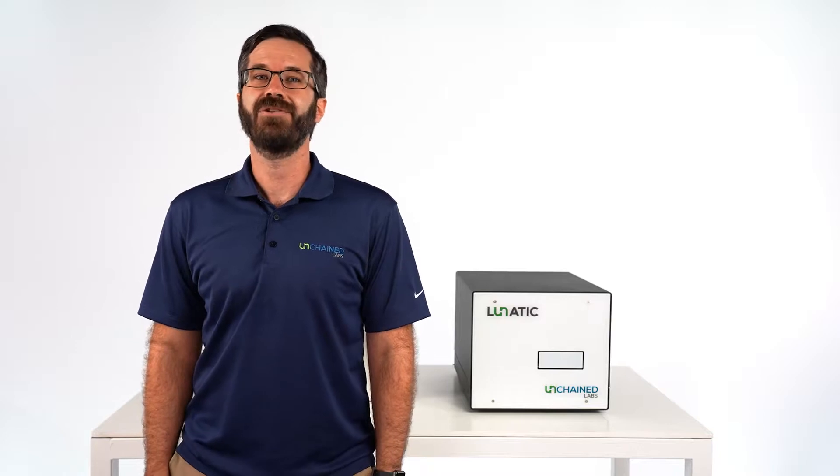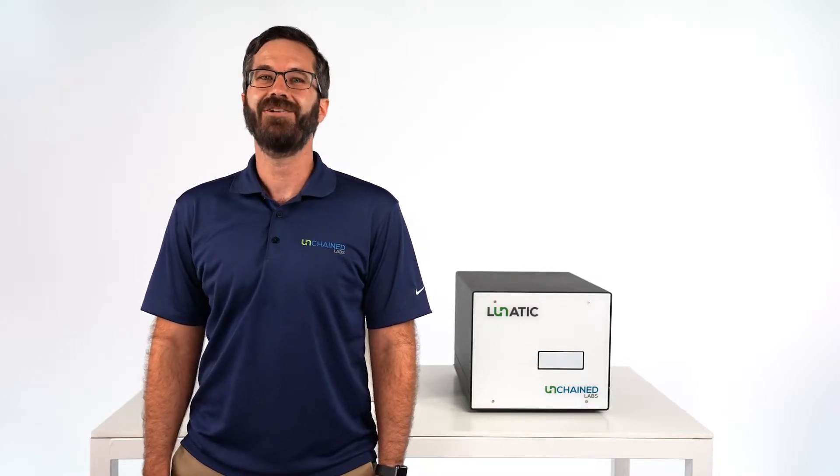That's a look at how Lunatic handles your quant problems. Join us next time as we tackle more science.